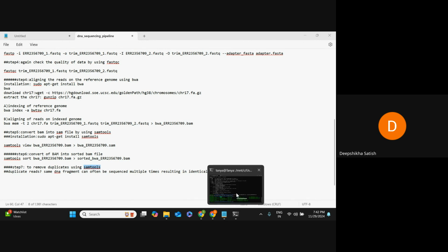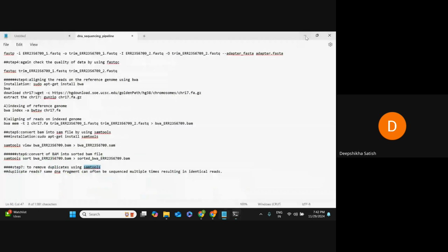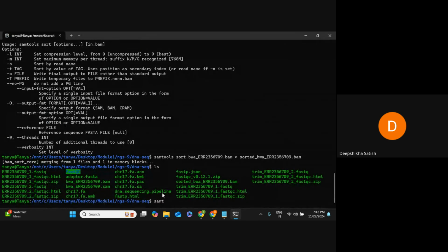So let's see. Okay, let's make the command for that. Again, you call the SAMtools. Okay, let me just show you the manual first.